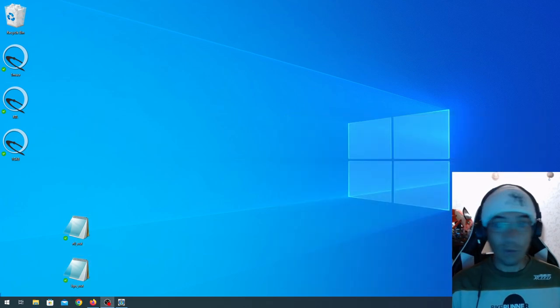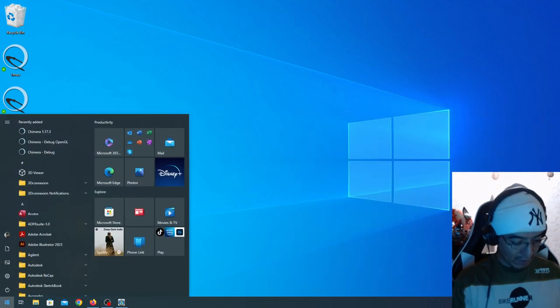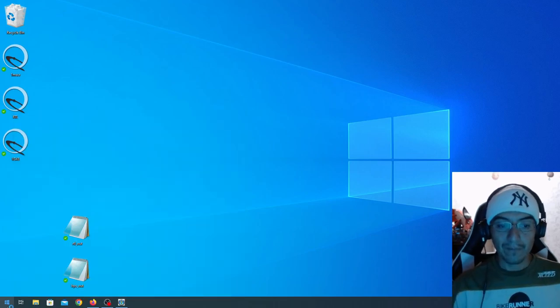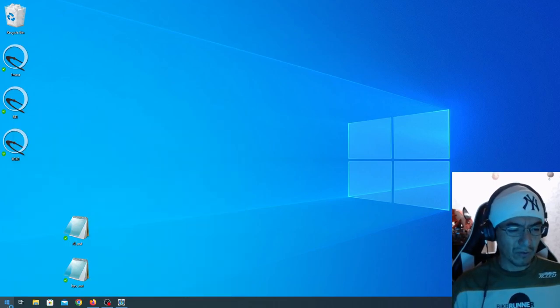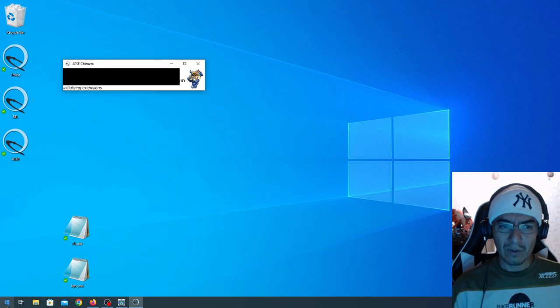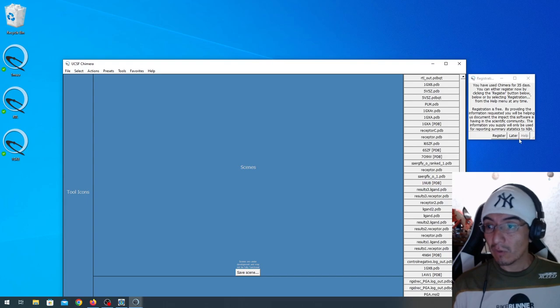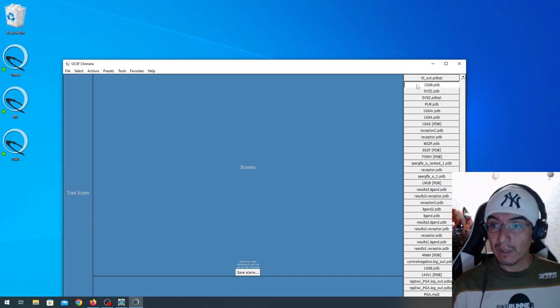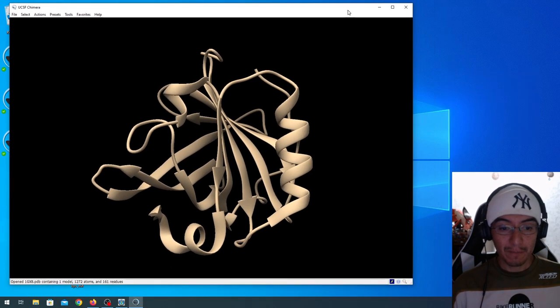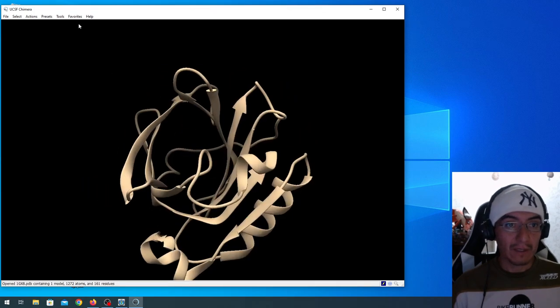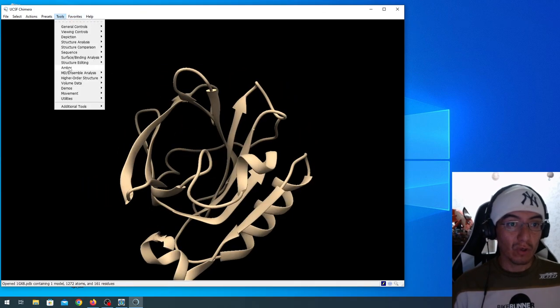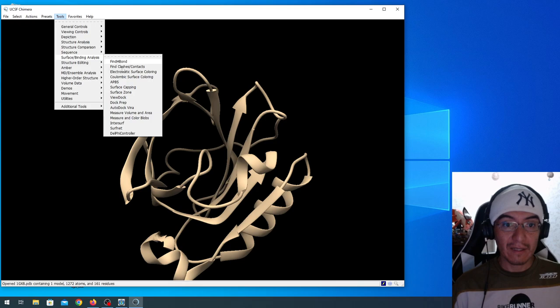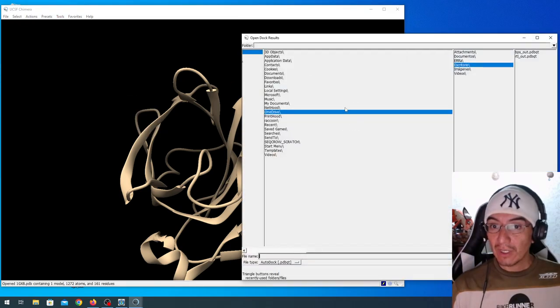Oh, I think I opened the wrong Chimera version. That was not so bad. I'm going to open 1GXA PDB. Perfect. And then, on Tools, Surface and Binding Analysis, ViewDock.